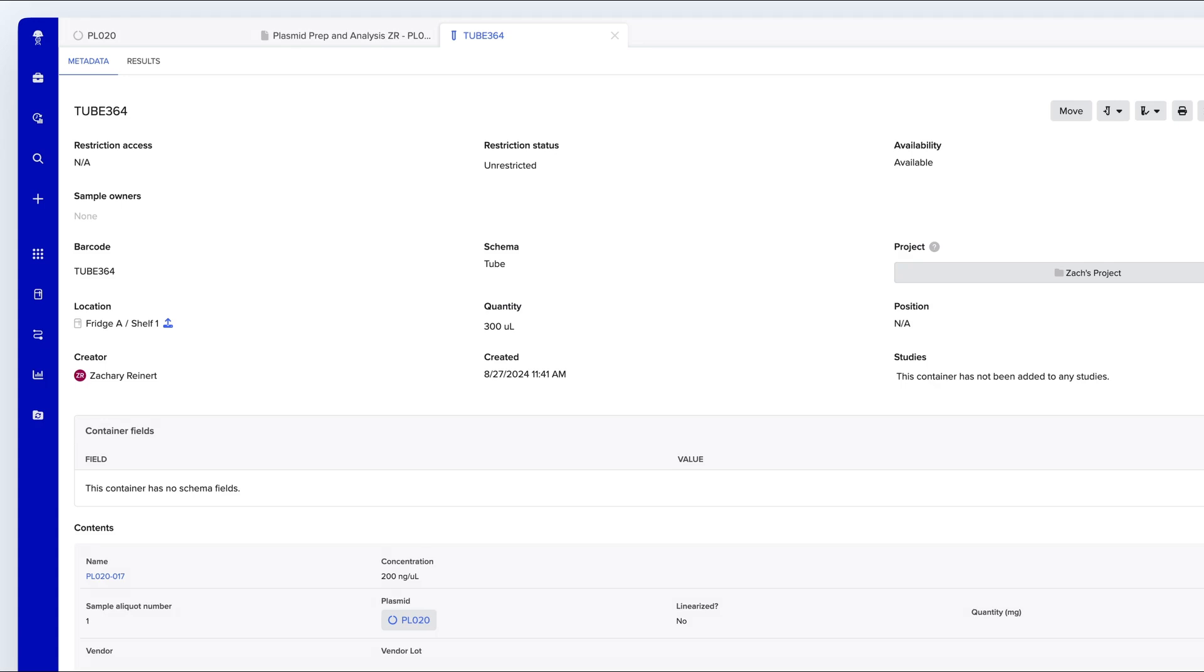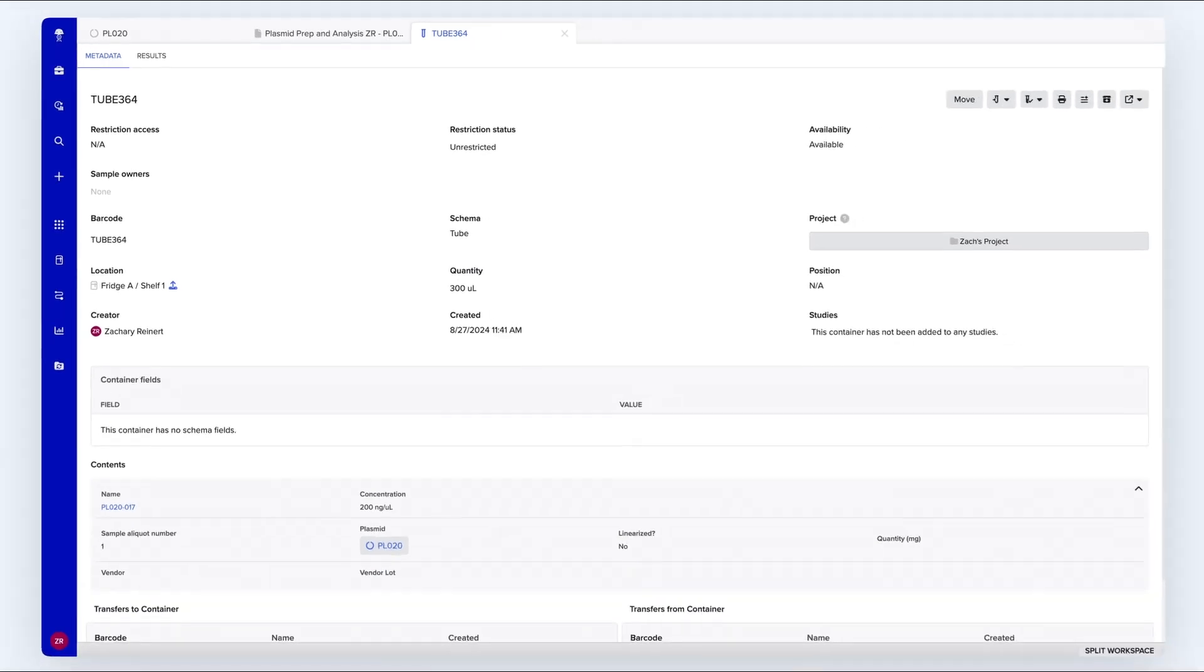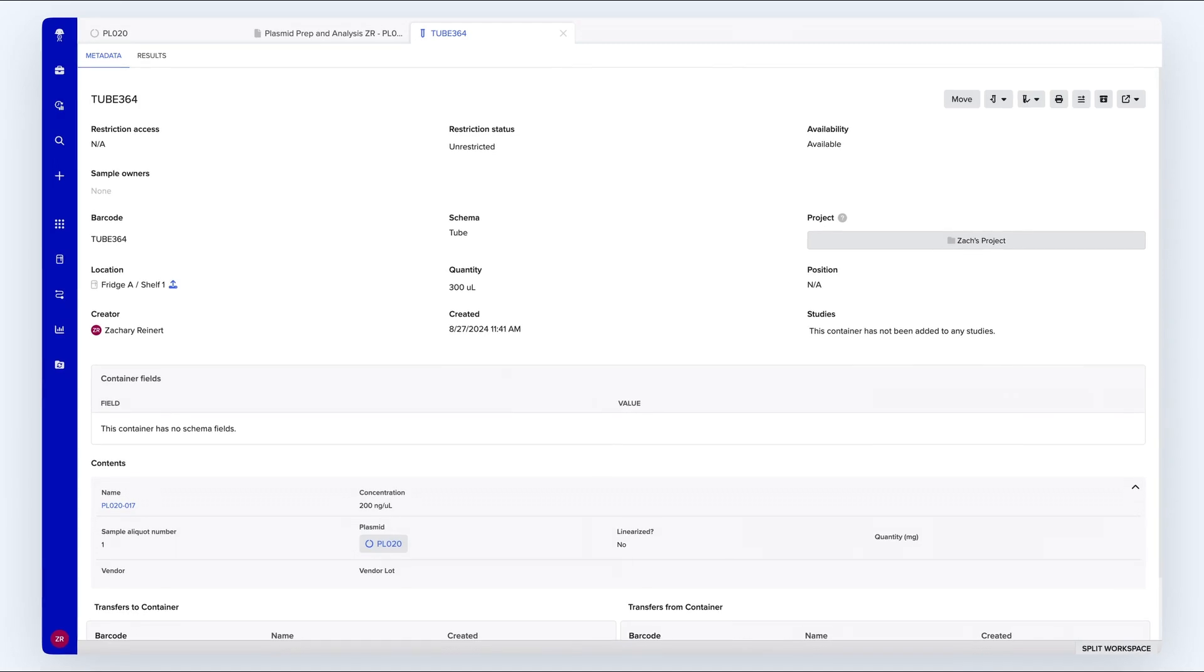From this view, you can also perform a variety of container actions such as moving containers, transferring contents, or reserving containers for future use.